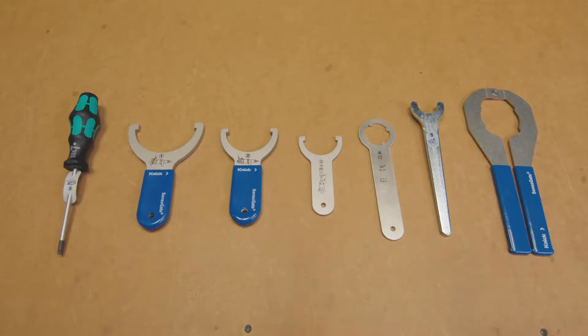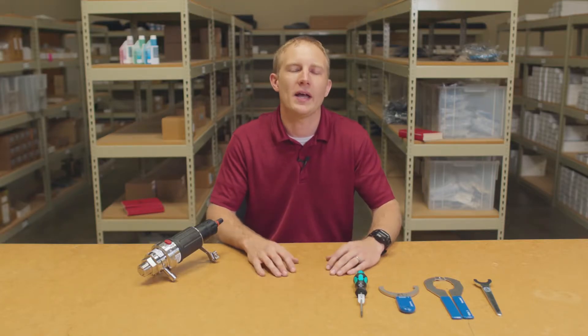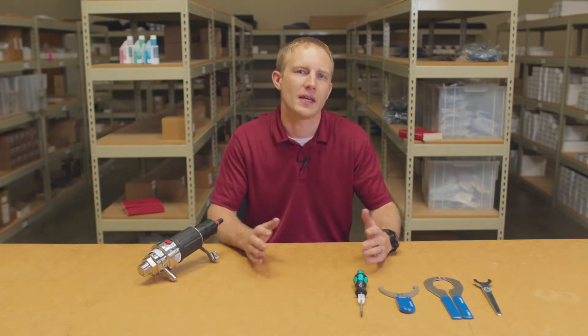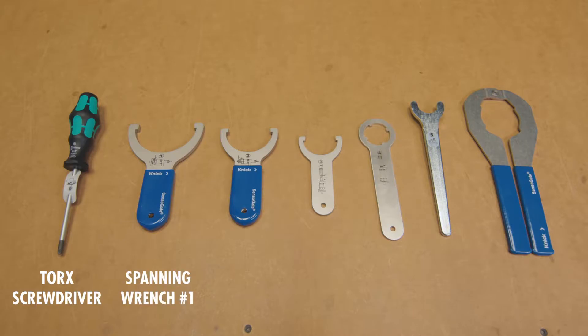I will be utilizing the service tool set. It is designed for easy maintenance, repair, and retrofitting of the device and can be purchased separately. For this process we will be specifically using the torque screwdriver, spanning wrench number one, pliers, and spanning wrench number five.